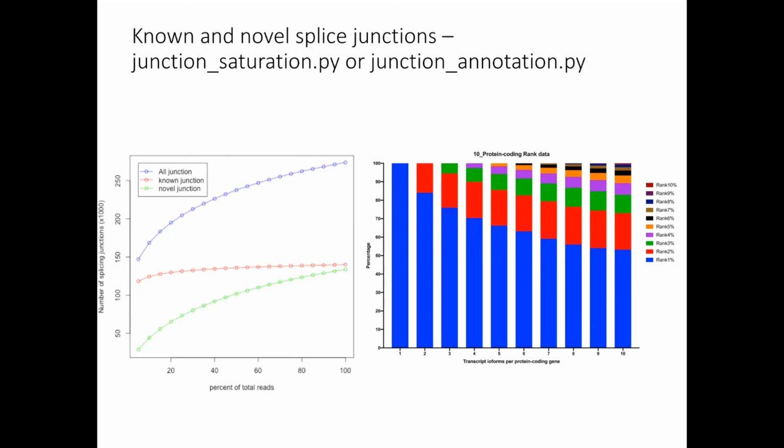Just summarizing what Johan also said, and a view that we usually share: RNA-seq will not prove that, for example, a splicing junction is very important for your data set. You might find many relevant findings, but in any sequencing data you also need to validate with another method to prove that it is actually happening.